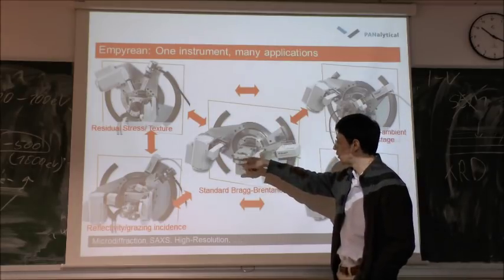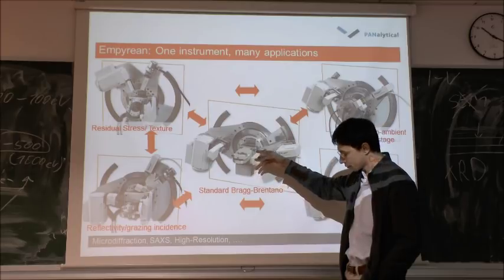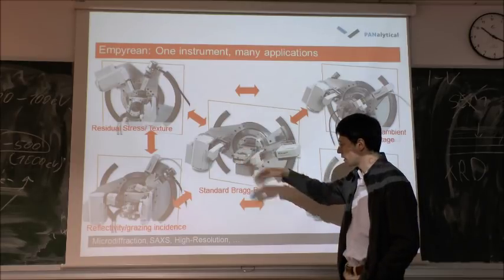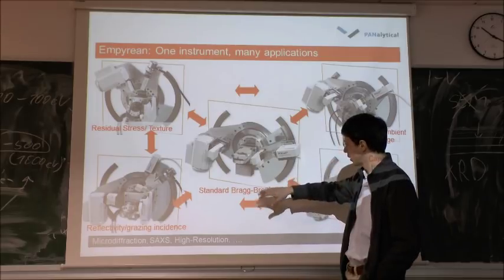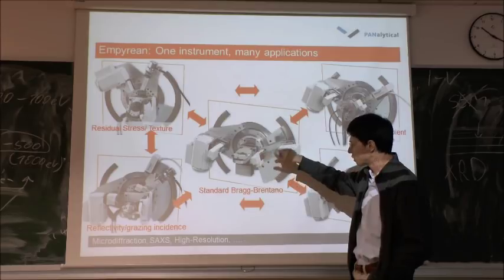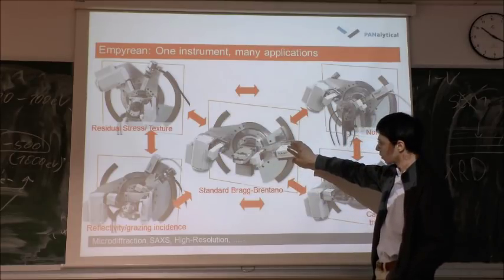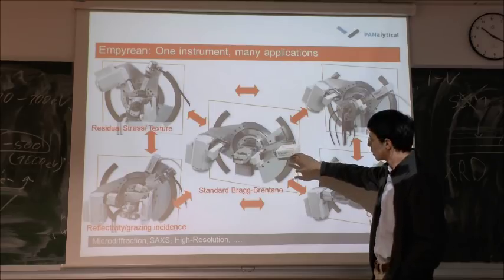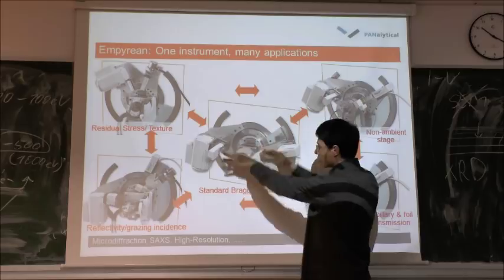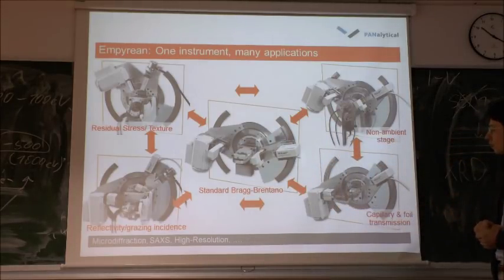Here exactly we have a spinner, meant for powders, and the powder rotates while the sample is being recorded. And then we have the diffracted part. Here we have different slits, monochromators, etc. And the detector. This is again one very important part. So with the goniometer, you move these two arms in a certain way so that you bring your crystal into the diffraction condition.